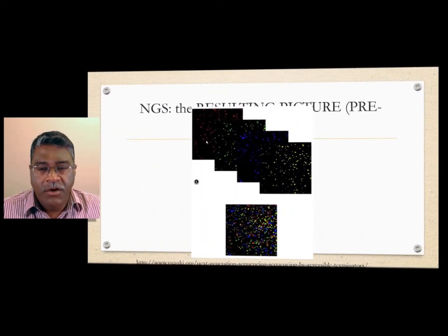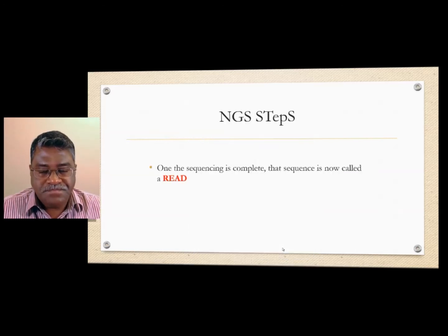And that's important. Okay, so what you see here is a picture that's taken of this nucleotide, so you know exactly at which spots in your lawn, for example, your DNA sequences are being developed. So this fluorescence picks up a color, another color, another color, another color, and you notice something, that obviously they're not the same, because at any point in time a nucleotide is added, it is a different nucleotide, right? And then what you do is you create a composite of these pictures.